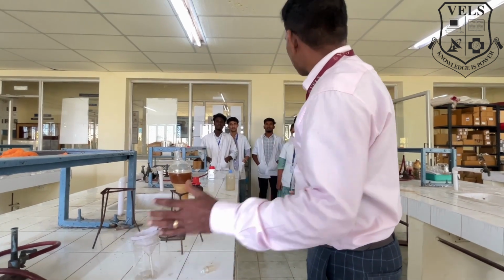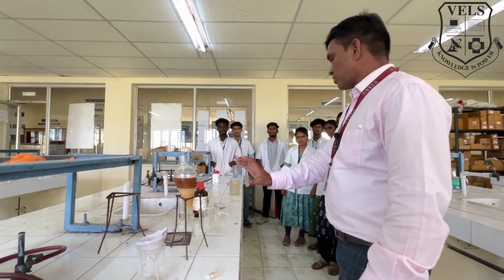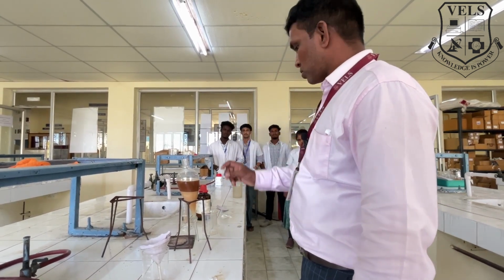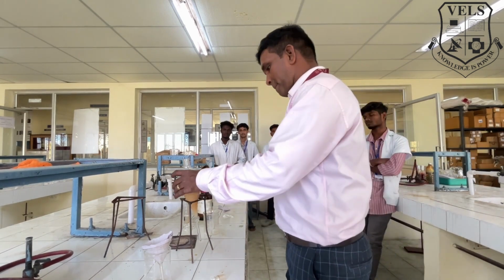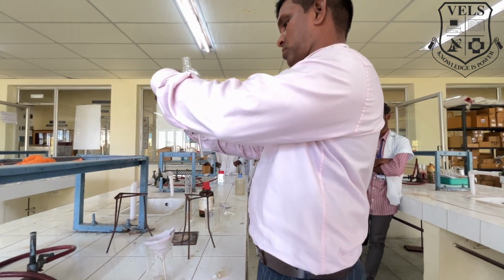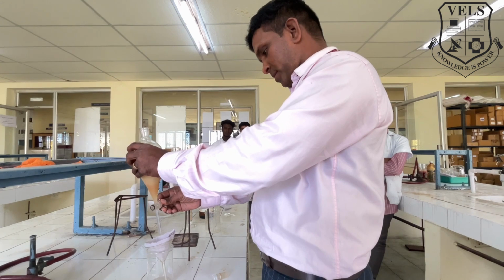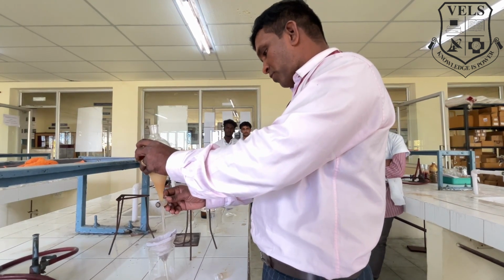After the separation process, we will see two layers. The bottom one is the chloroform layer, the upper one is the aqueous layer. In this chloroform layer only the product will be present. Gently open this knob and collect the chloroform layer.